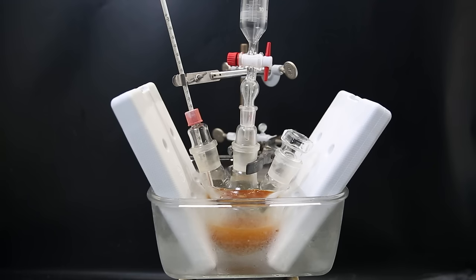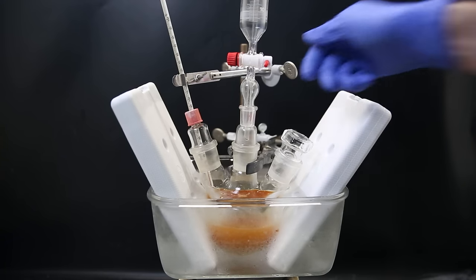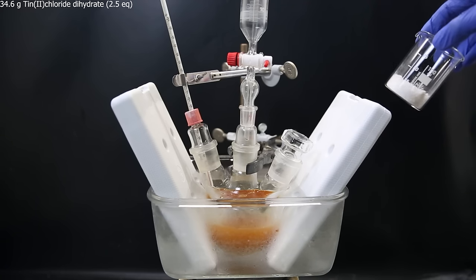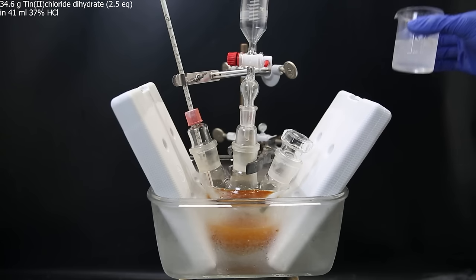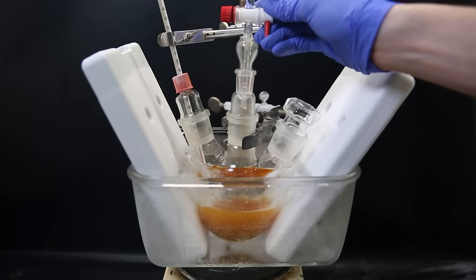When the addition is complete, the mixture has become dark orange, and I left it to stir for 30 more minutes. Afterward, I close the dropping funnel and immediately continue with the next step, which is converting the diazonium to a hydrazine. To do that, I weighed out 34.6 grams of tin(II) chloride dihydrate and dissolved it in 41 mL of 37% hydrochloric acid. I add all of it to the dropping funnel and then slowly add it to the flask, while keeping the temperature below 5 °C.